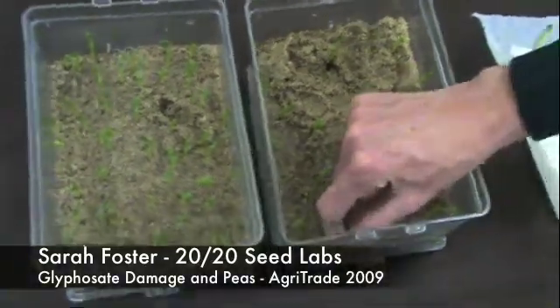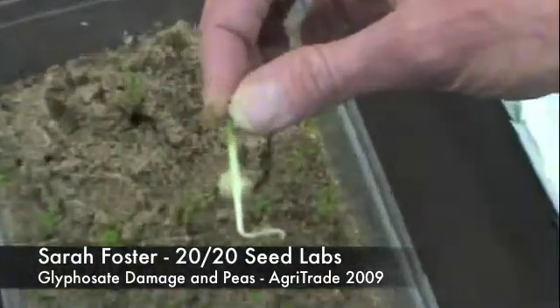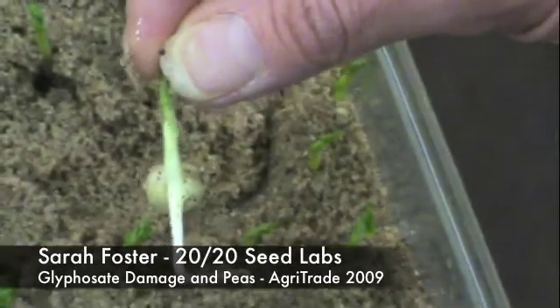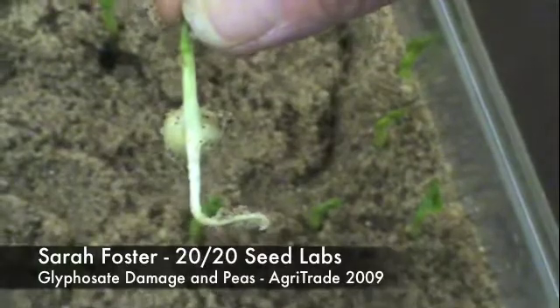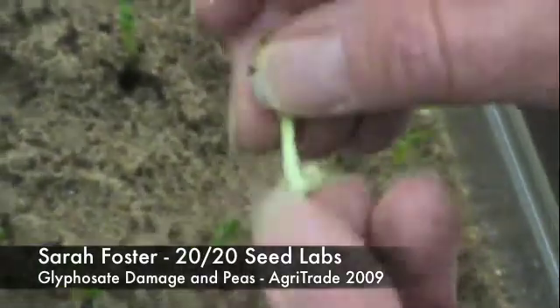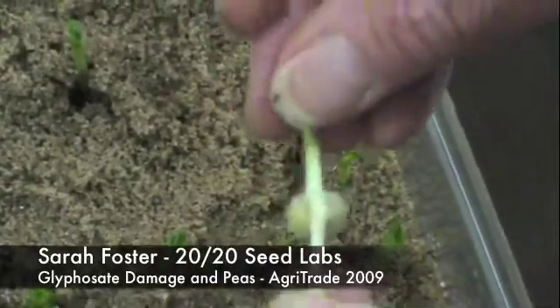If I was to pull this one up, you can see here the glyphosate has affected the roots. We have a reasonable primary root, but no secondary root growth, and certainly no root hairs if you look closely. The seedling is also very, very brittle, which is a good indication that we have chemical injury.